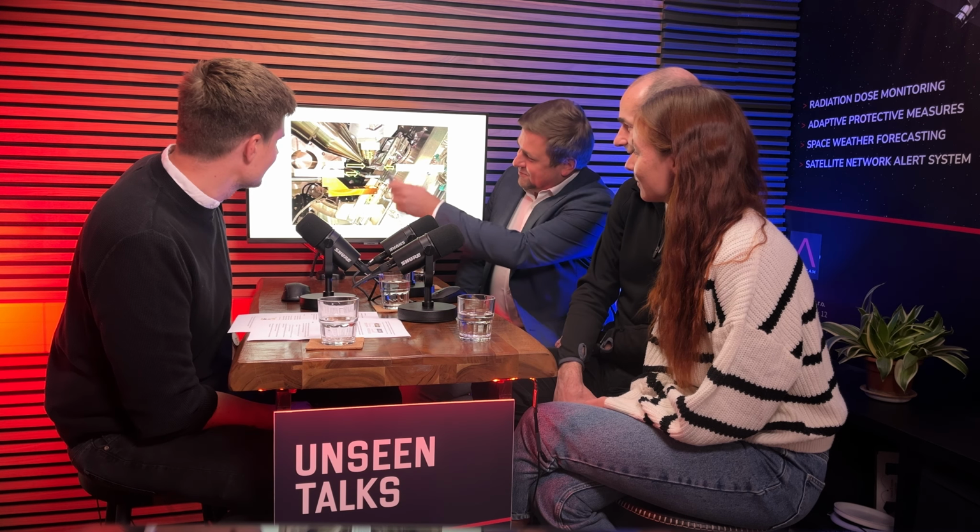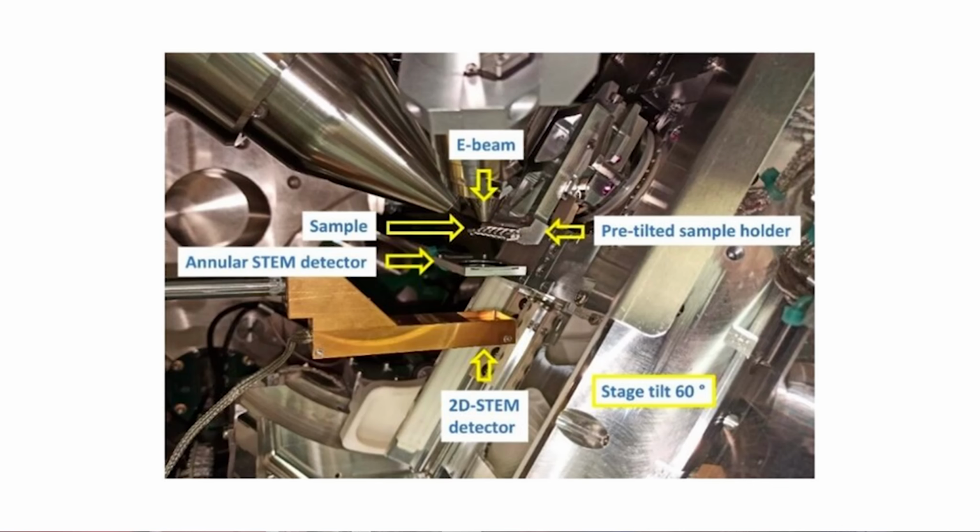Yeah. Before we jump to the data processing, this image shows the implementation. Maybe Pavel, tell us what we see here. Well, you can, if I may use your pointer. Here you see the pole piece of the electron column, so the electrons are coming from the top. Then you put the sample on this holder, which is depicted here, and then you have a variety of detectors. This is a standard STEM, which is just a segmented diode, and then our detector, our pixelated detector, is here in the bottom. So as you're scanning your beam over the sample, you're collecting the data using this detector. Yeah. Thank you.